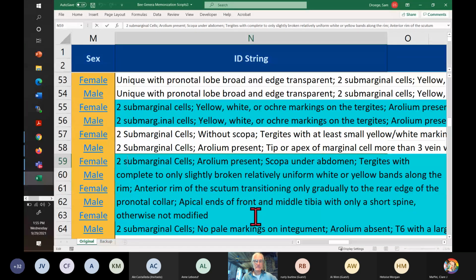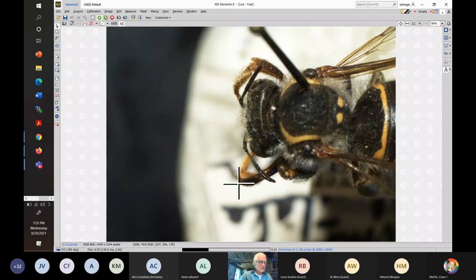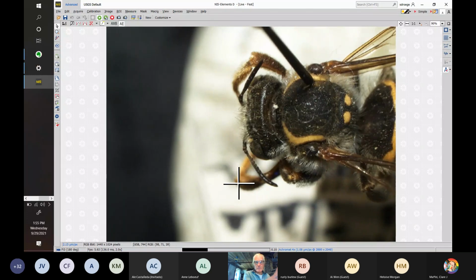We'll look at that. Apical ends of front and middle tibia with only a short spine, otherwise non-modified. These spine things, I'm not sure. It sounds like that was what Dianthidium had too, but let's take a look under the microscope at this ancient specimen, which might be like 100 years old for all I know. It's certainly dirty enough to be 100 years old.